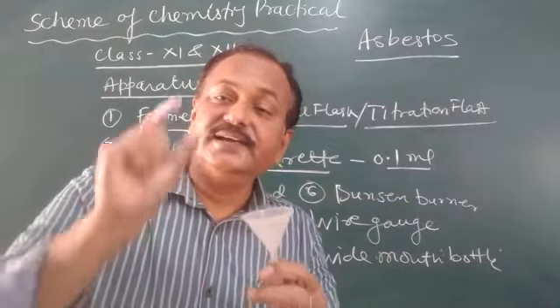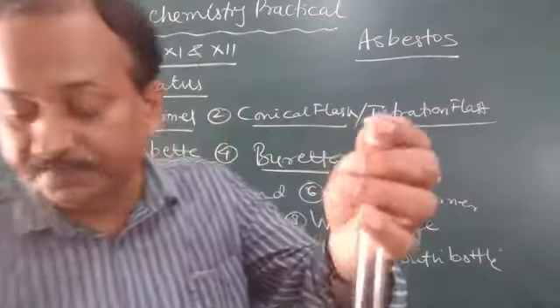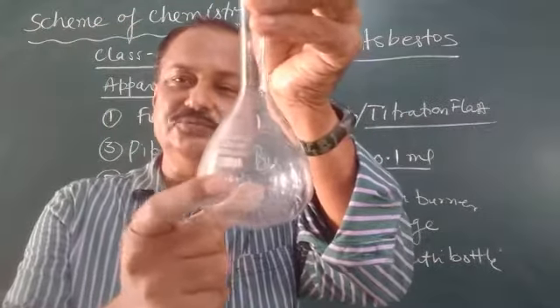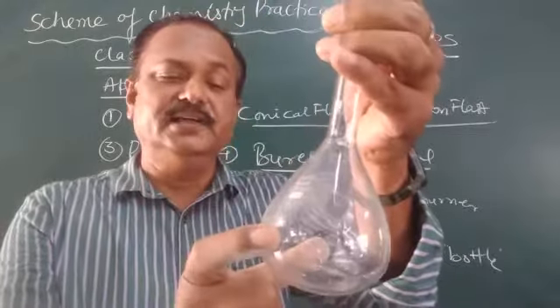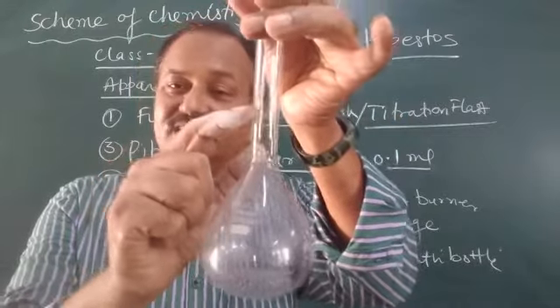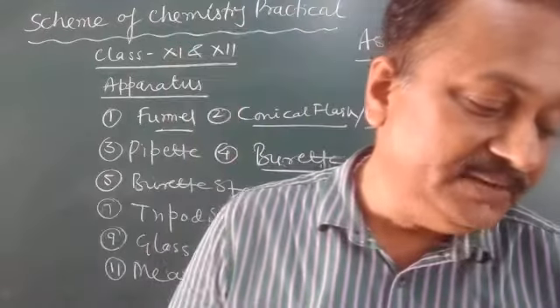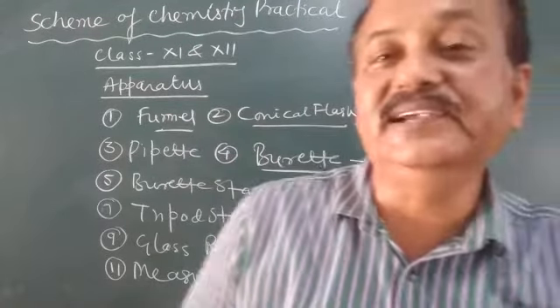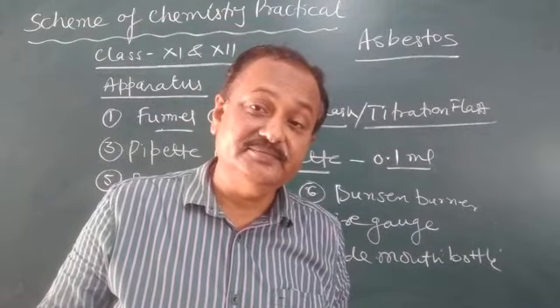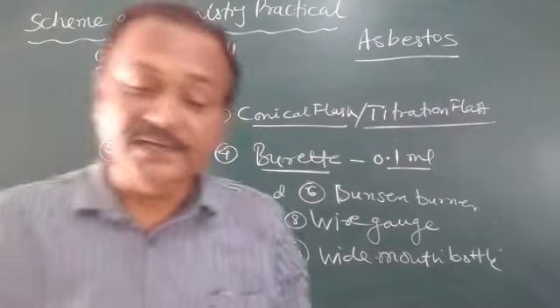So for preparation, take the salt, put it here, add a little amount of distilled water, and see, it is written 250 ml, and the temperature is mentioned. It is 27 degrees Celsius. And see here, the mark is there. You have an idea of molarity and molality. Molarity is affected by temperature. So on all the apparatus the temperature is written.